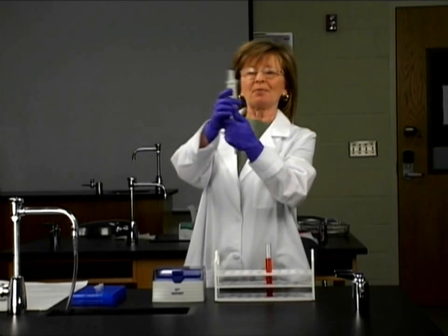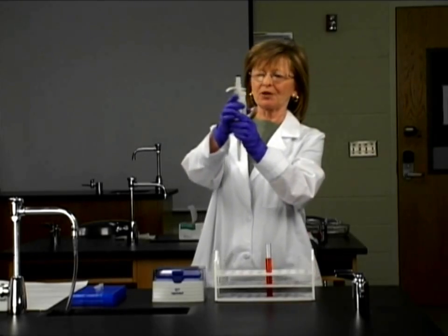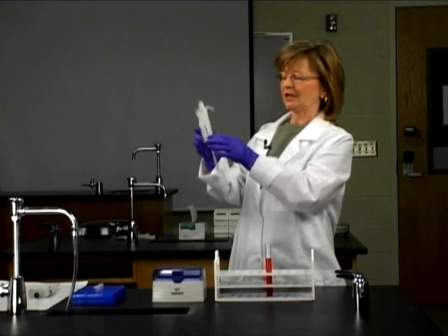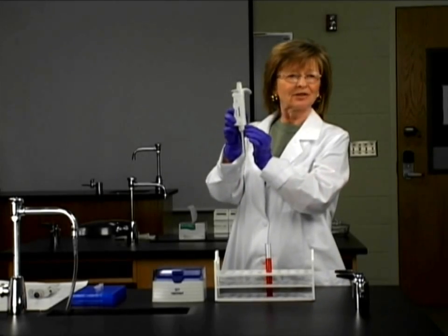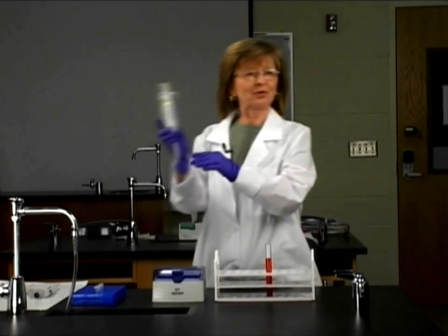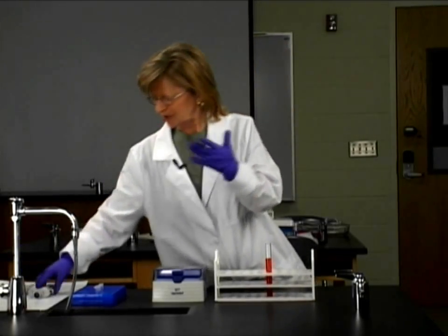This is a micropipet. This happens to be an Eppendorf, and of course there are different volumes of micropipets. Here we have a 10 microliter micropipet, a 100 microliter micropipet, and there are different volumes.